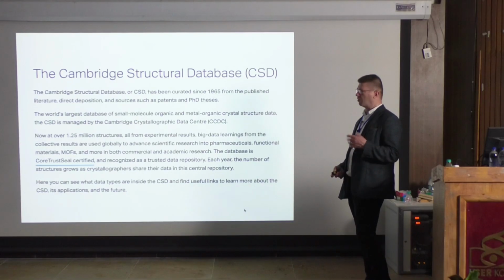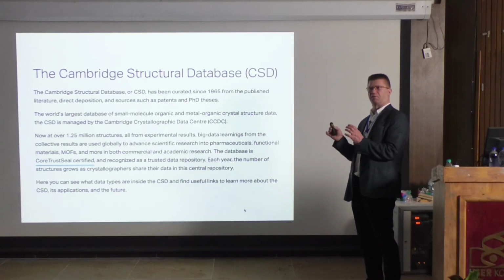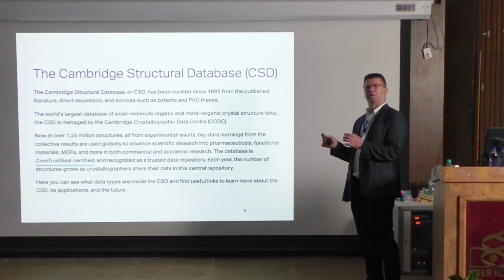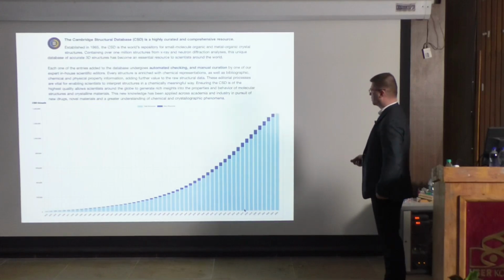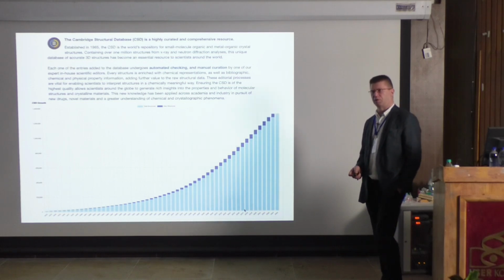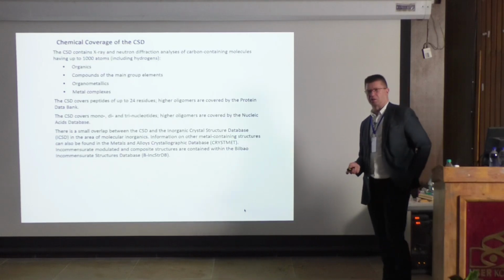And referees, like myself, often check. If somebody says, this is now the first time in the world, I say, I don't believe you. I'm checking from the Cambridge Structural Database. And it's used. This is an old picture, but now we are somewhere at something like 1.3 million, 1.4 million structures. And it contains everything except purely inorganics.